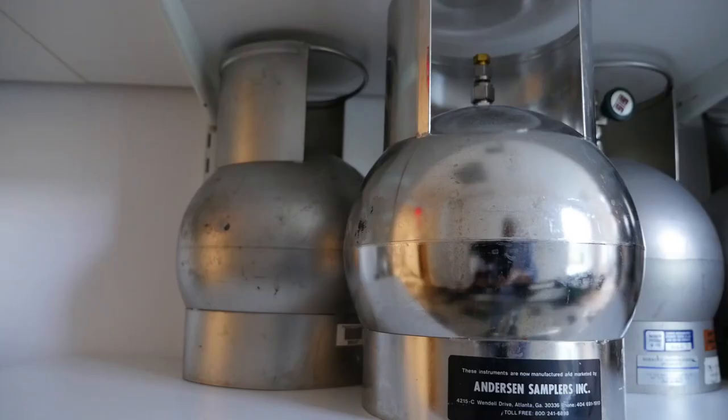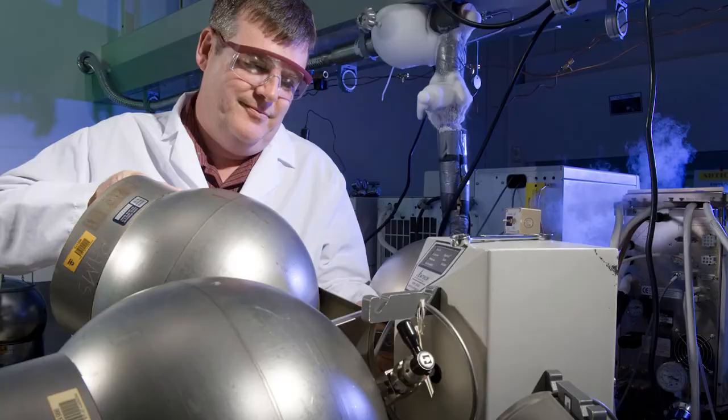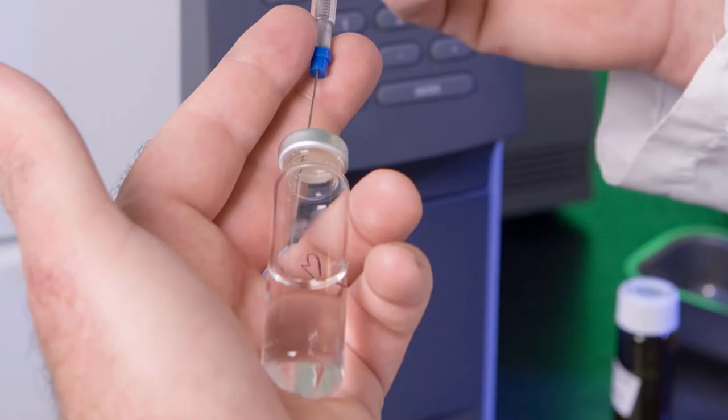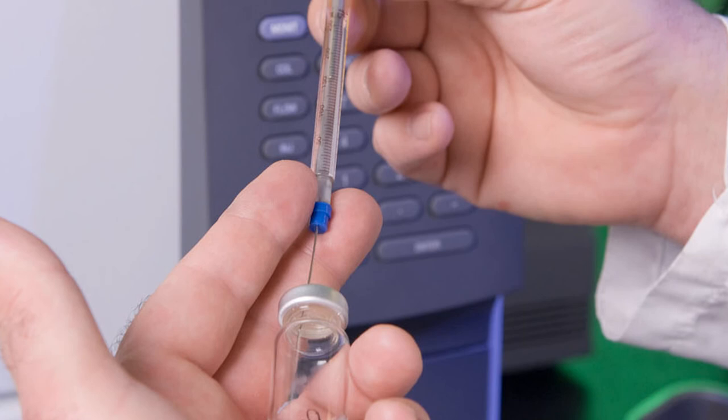Once the samples leave the site, we put them on a chain of custody and we bring them back to the lab here where they're logged in and then our chemist will perform the analysis.